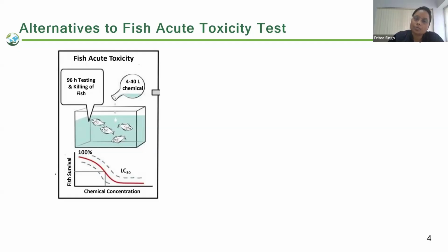So to determine the more accurate LC50 value, here we are performing the study in two phases. One is a preliminary range finding study, and the second one is the main study or definitive test. So for a single phase, that is a DRF, preliminary range finding study, also called dose range finding, a wide range of concentrations are selected, and based on this concentration, the main study is performed. So in a single phase, that is a DRF or main study, around 60 to 70 fish are utilized for a single phase. Then counting both phases, around 120 to 140 fish are utilized.